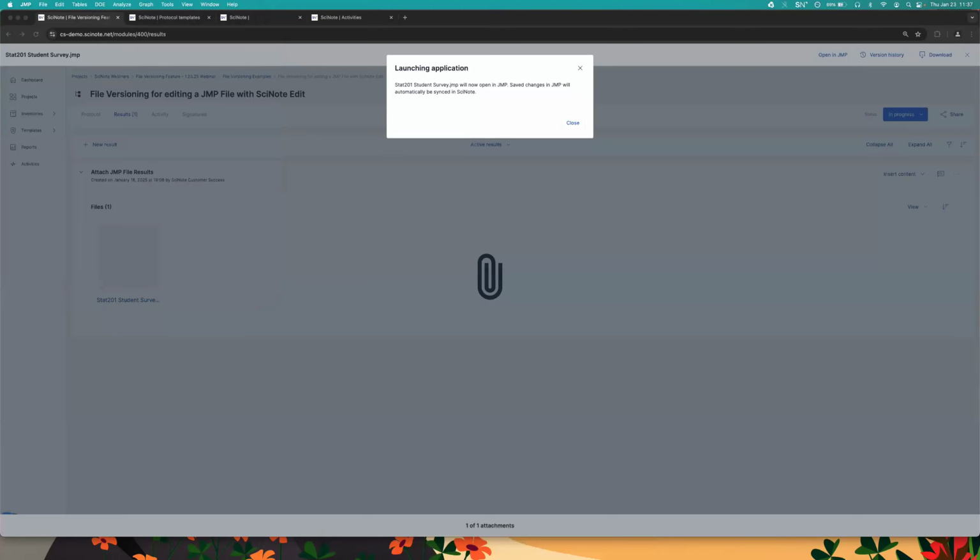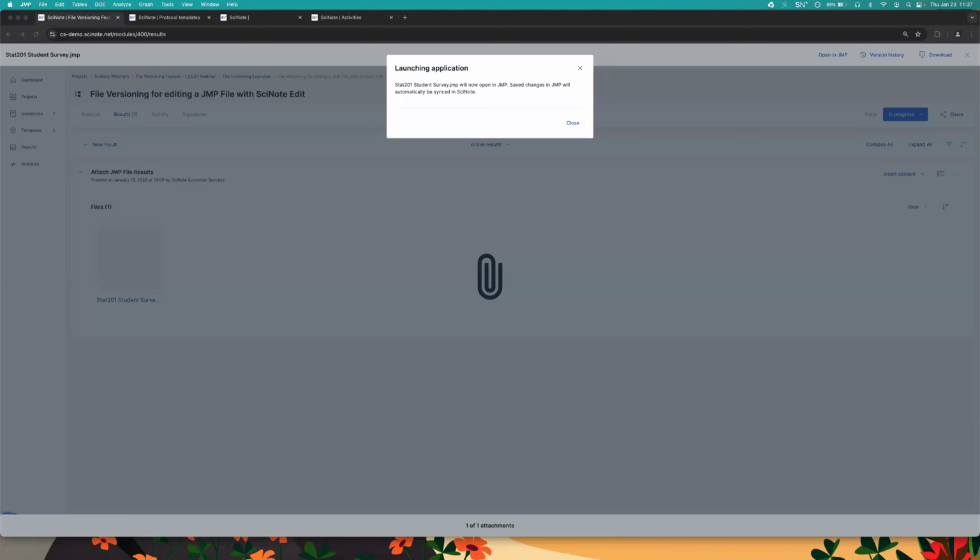Yeah, Nate, go ahead. I was going to say yes. So one more question came in. Can we open Prism files? So the answer is yes. Are you using a Mac or a PC to access these files? There are two different versions of SciNote Edit. So just so you're aware of that, you can use it with Mac or PC devices.